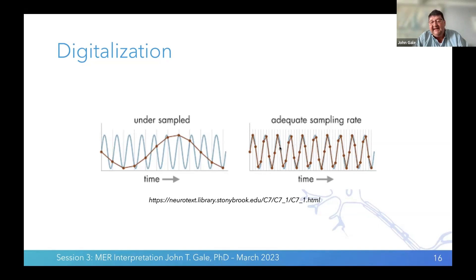If we sample fast enough, when we connect the dots, we actually see the underlying frequency. This is undersampled; this is sampled appropriately. You can also oversample — getting many more dots — which isn't really a problem other than it takes a lot of memory and storage. If you sample adequately, you'll see the underlying frequency of the signal you're interested in.